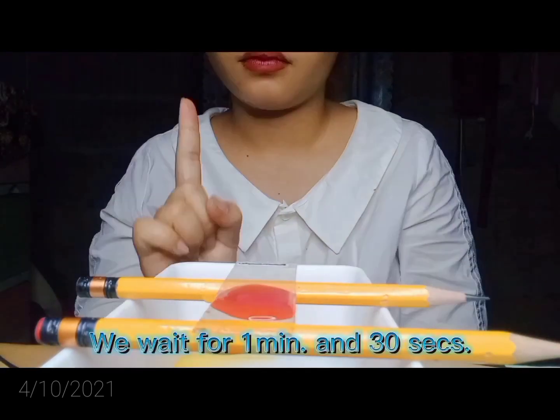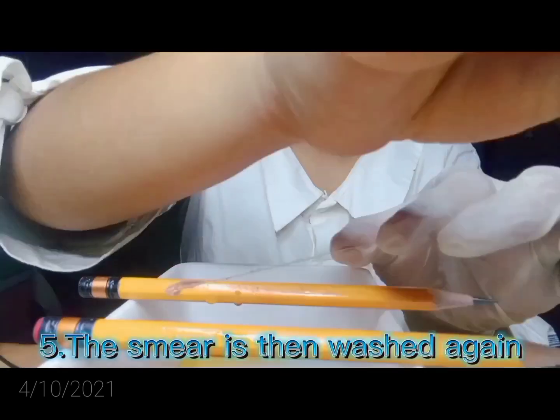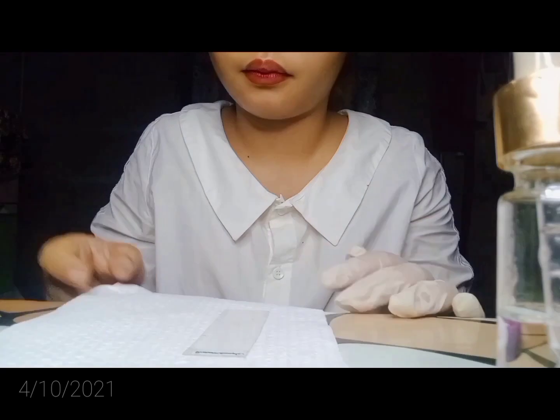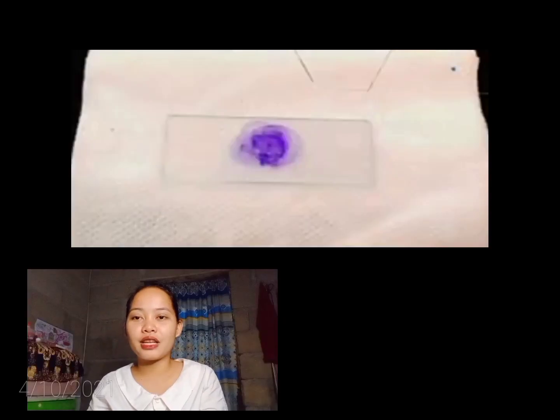We wait for 1 minute and 30 seconds. Fifth, the smear is then washed again and blotted dry, ready for microscopy.